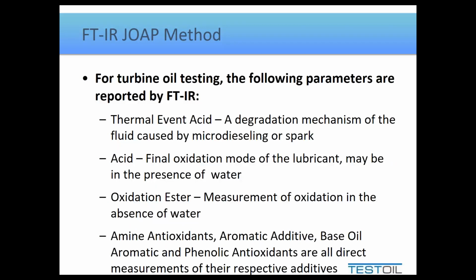One quick note about aminic and phenolic antioxidants is that though an oil may have an antioxidant in it, it can have simply an aminic or a phenolic additive, or it can have a little bit of both. ASTM does recommend that if it has both types of antioxidants in it, that you are primarily concerned with the aminic value, not so much the phenolic value.